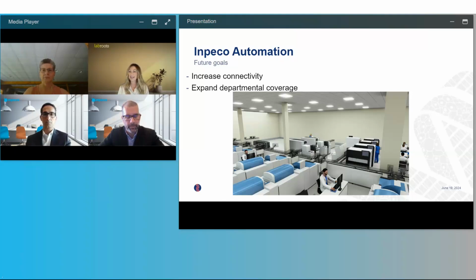Thanks, Tommy. Okay, and Kathleen, I believe this one is for you. It's a couple parts. Is there a plan to develop a way to deal with pediatric small test tubes? This may give a unique advantage compared to the other competitors. And two, if we offer the current automatic system to customers in a tender during 2024, do you think we can claim that in 5 to 7 years, at the end of the contract when they want to replace the analyzers, it will be possible to connect new analyzers to the system?